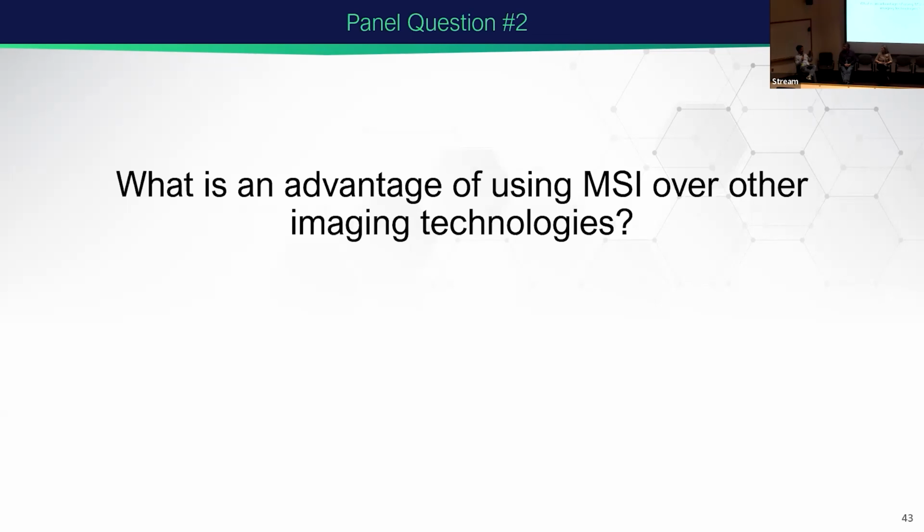there is almost no way we can do live imaging. It's unlike fluorescence imaging. You have to fix the samples and then put them into the vacuum or outside, and then inject them into the mass spec. So that would be the major limitation, that there is no way mass spec imaging can overcome compared to some other technology.